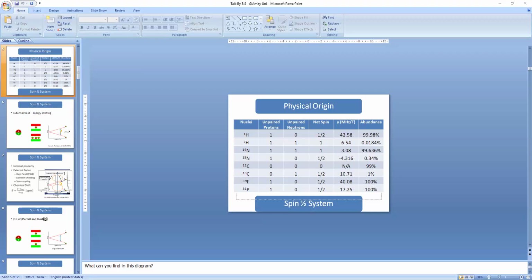Okay, so this is just to give you an idea of a large molecule where you can see different kinds of chemical shift and anisotropy on the same slide. And if you move to the next slide, okay, so here you can see again in equilibrium.